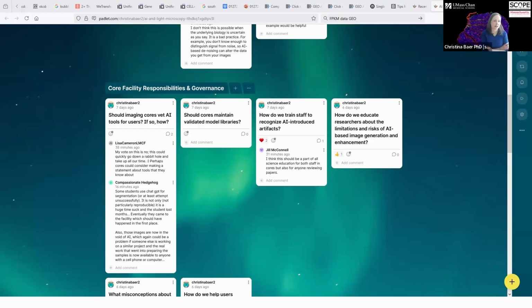No, I like it. And I think that's definitely an area that is super important for us to emphasize for our users, right? I have a lot of users that are microscopy novices, perhaps, and come in and really want us to set the settings of the microscope for them. And then we may find out 3 years later they've never changed the settings because they just assume that they're right because we helped them with that, right? And that becomes a user education issue. There's a certain amount of accountability for your own science that is both a challenge, but also at the same time very essential for us to teach all of our users and people that we're trying to do science with. So given that, Doug, do you have any perspective on that based on your years of experience?